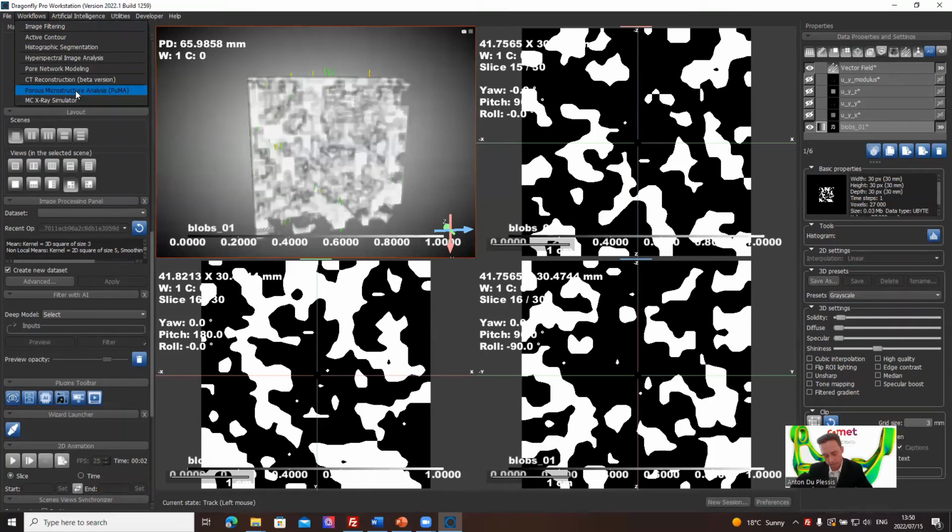Word of note here, the calculations are quite intense on memory usage. So it might take a lot of memory. So use small data to start off with before moving to large scale data. Right, so that's all I wanted to demonstrate right here.